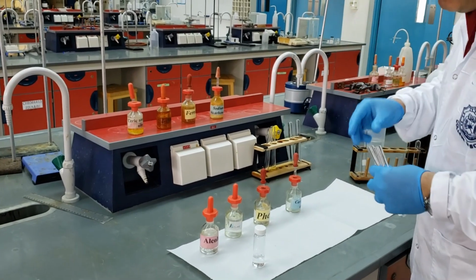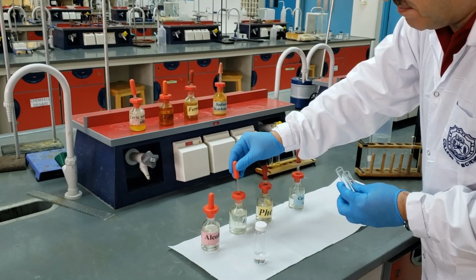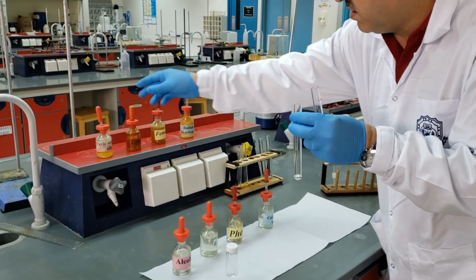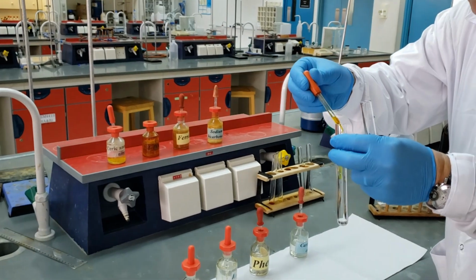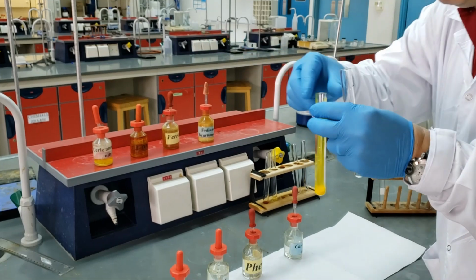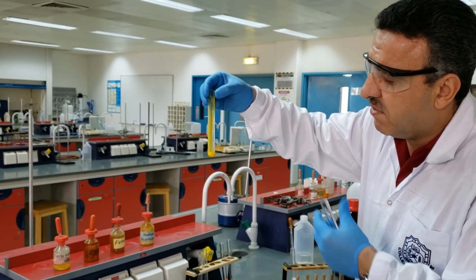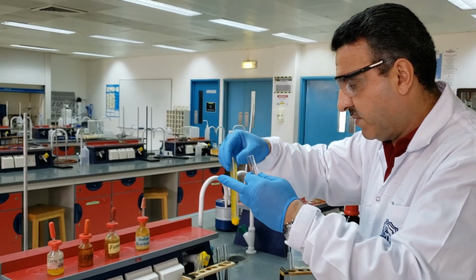If we go for ketone, just to check if our unknown compound contains ketone or not, first we start with the ketone, then we add the reagent, which is 2,4-dinitrophenyl hydrazine, and see what's going to happen. You see, the ketone gives a positive test, which is simply the formation of a thick, very distinct yellow precipitate.